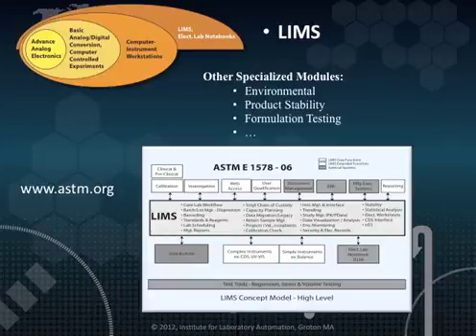In order to do this, an array of tests is automatically set up to look at certain product characteristics periodically over time. In traditional LIMS, each set of tests for each sample over the time period of interest would have to be added one sample at a time. In a system designed for stability testing, the basic characteristics of the project would be laid out for the samples and test requirements automatically filled in.